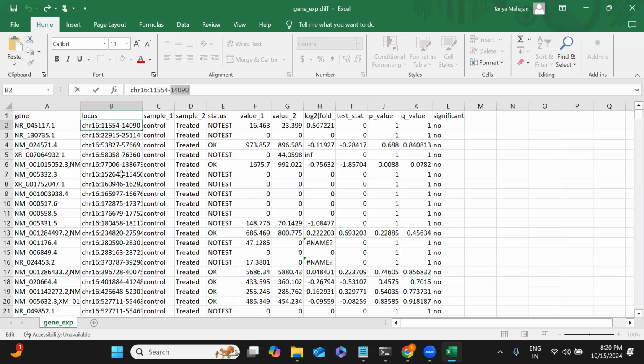You can check it from chromosome 16. When you download chromosome 16 from UCSC and also from NCBI, you will get the start and the end position of chromosome 16. So we are discussing chromosome 16. There are multiple locations you will get, right? And that location is of the transcript, correct? Now at home, what you can do, just open chromosome 16 from NCBI and you will get that start and end position there. Let me complete and I will take all the queries afterwards, otherwise it will confuse others also, please.